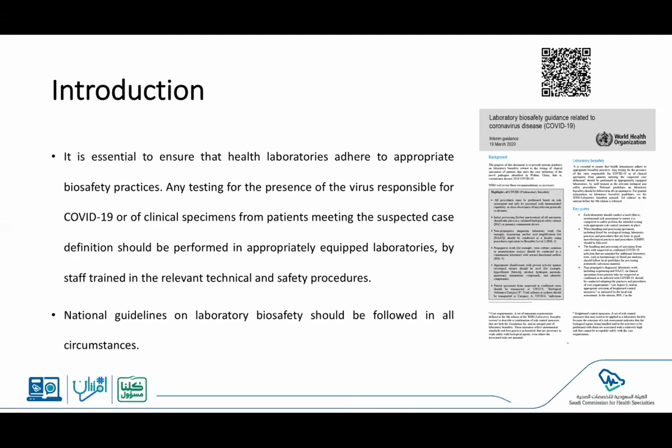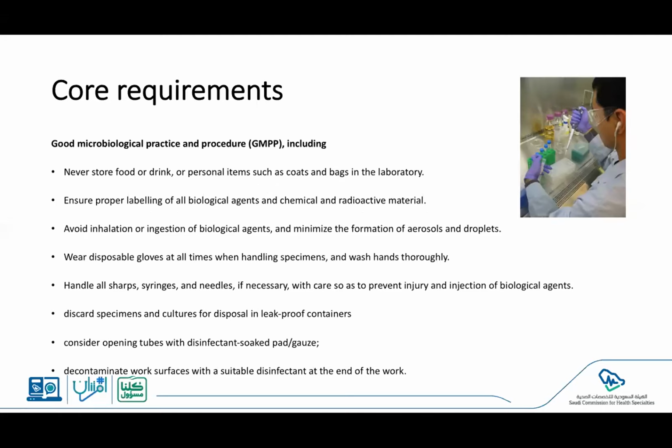But what I'm going to go through is the minimal requirements that were put together to make sure that it's universally applicable throughout the world. So first things first, the core requirements. The core requirements are the basic requirements that need to exist in all laboratories throughout the world, and particularly those handling microbiological agents.